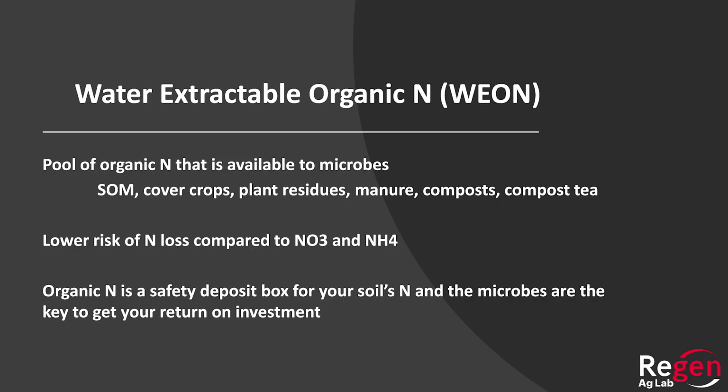The other thing we measure on the water extract is the water extractable organic nitrogen. So I said we did organic carbon, now we'll look at organic nitrogen. This is all that nitrogen that is not in nitrate and ammonium form. Most soil tests focus strictly on nitrate. If you're lucky, you get ammonium. And if you go east of the Mississippi, I know that's a long ways from here, guess what? They don't even measure nitrate. They don't measure nitrogen at all. They just assume that whatever you put on the year before is gone the next year. No reason to test for it.